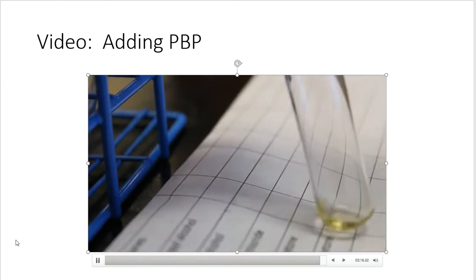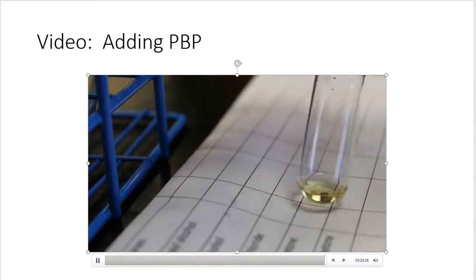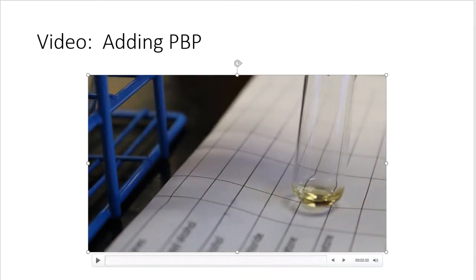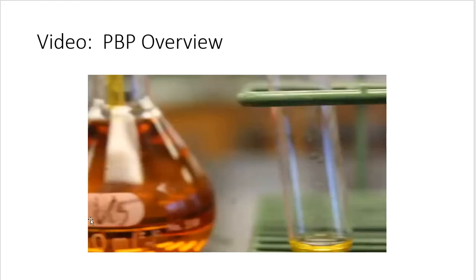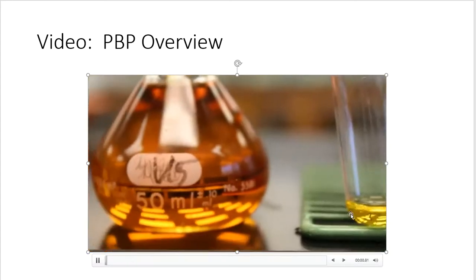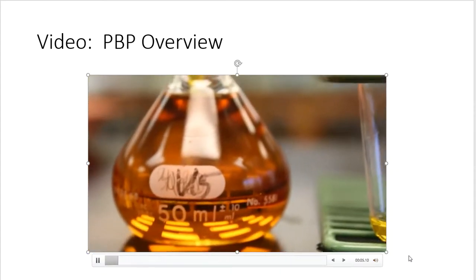And there it is. All right, so there's our starting PBP solution.